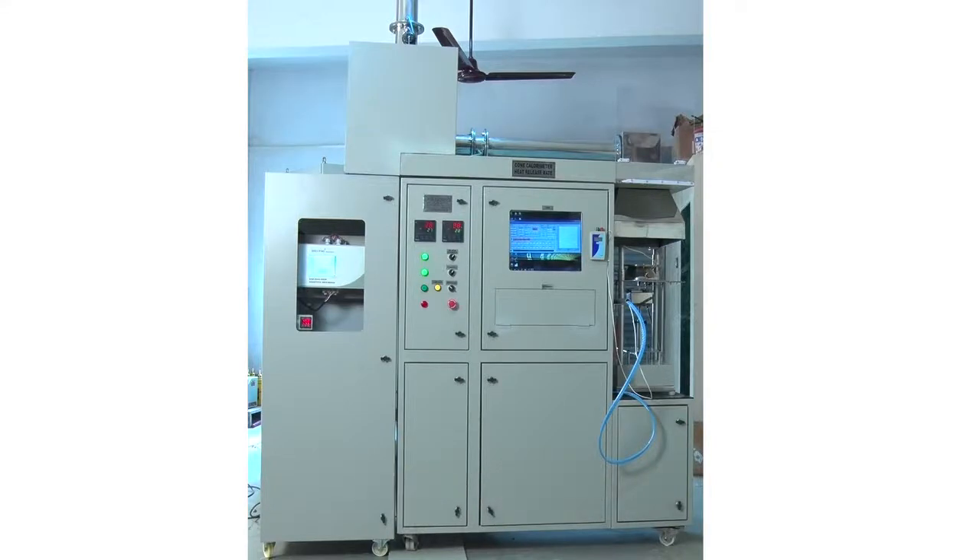This machine has 3 segments. First is the Cone Heater Test Bench, the second is the LabVIEW Software, and the third is the Gas Analyzer.